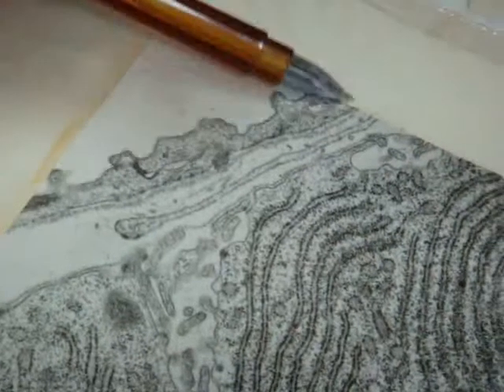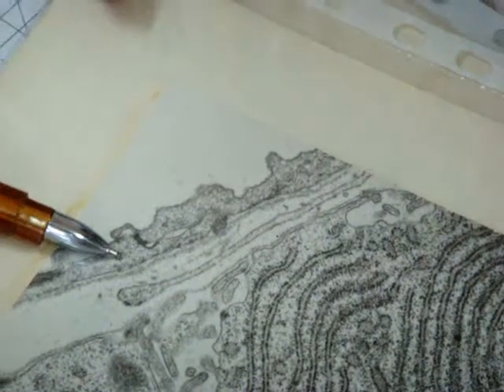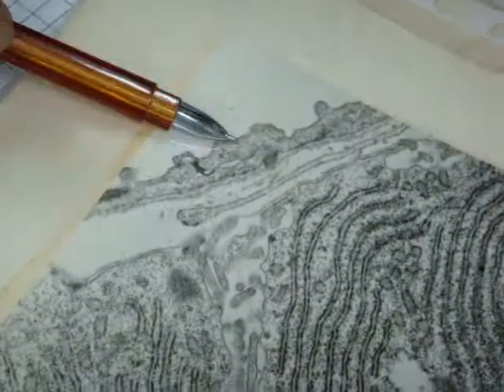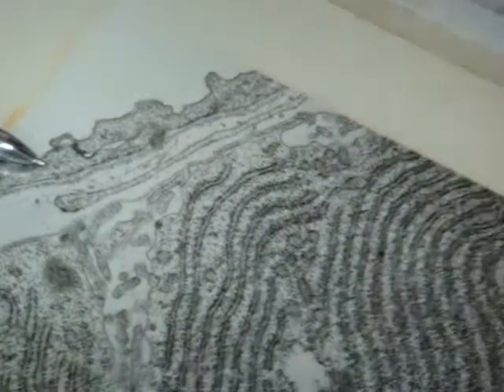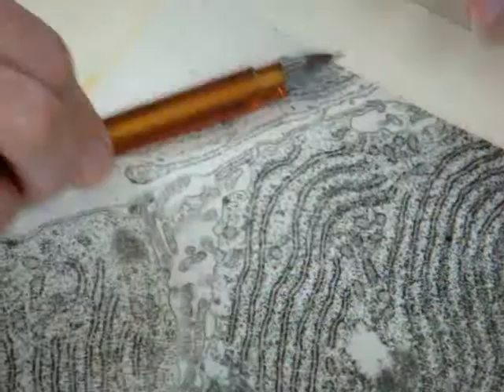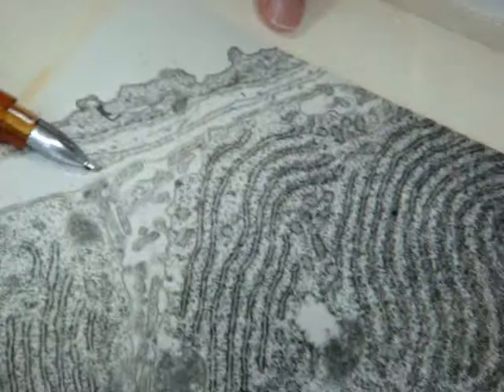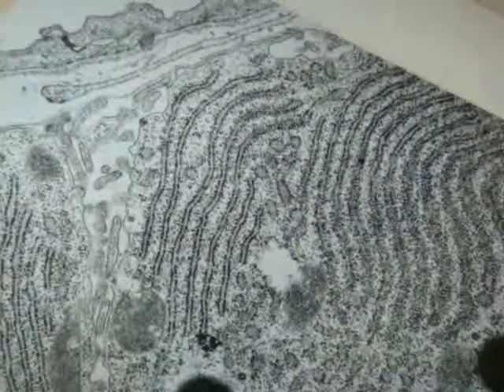Let's look here. We can see two flattened cells. They are joined with each other by intercellular junctions. Yes. So this is also an epithelial cell. They are flat, simple squamous epithelium. So what is it? Endothelial cell, lumen of a blood vessel, the basement membrane. Between two epithelial cells, we can see a process of a cell without basement membrane. So this process can belong to connective tissue. Fibroblasts, they have processes, yes? Nervous process.